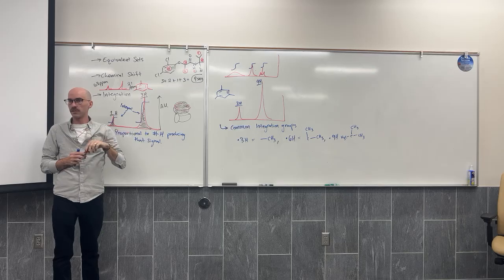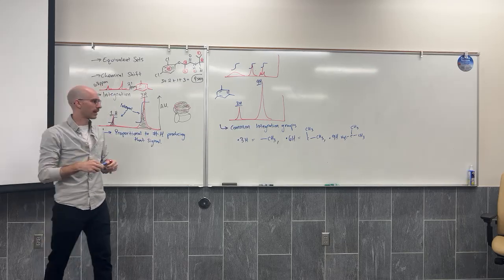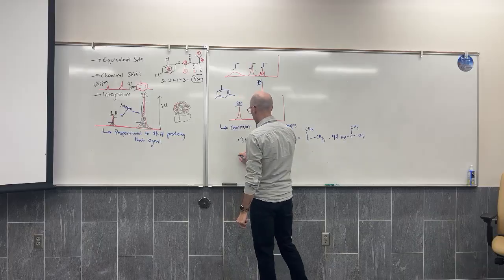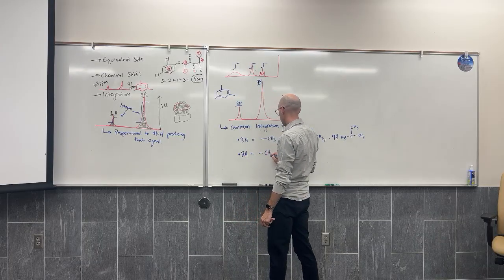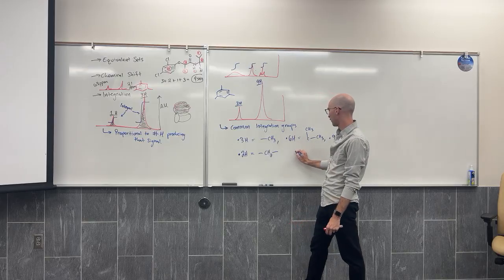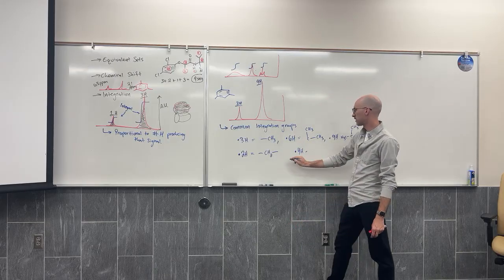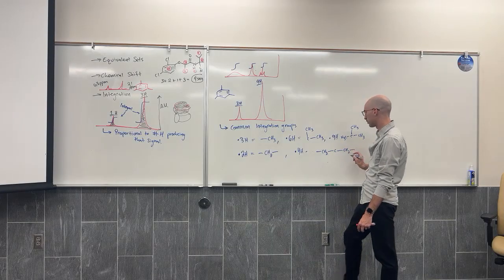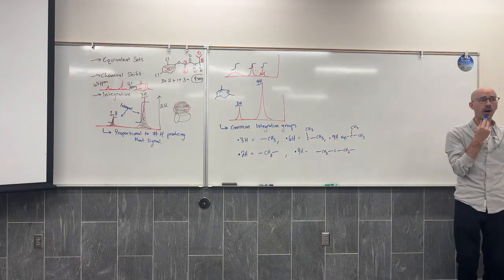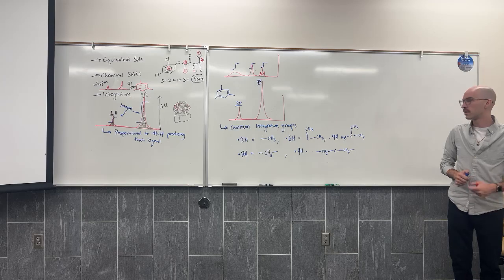In the aromatic region, I'll address this about the aromatic region. Just a couple of other ones. 2H often tells us that we have some sort of CH2 group, whereas 4H often tells us that we have some sort of symmetric CH2 groups. Often, I can't say always, right? These are just common things that we see.